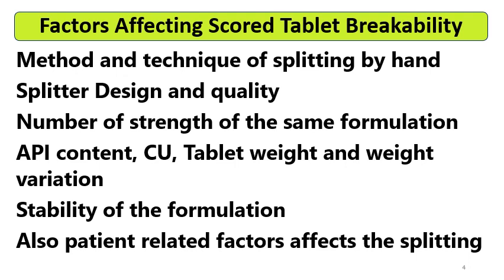So it is always desirable to have optimum hardness so that geriatric patients can split the tablets easily by hand. Always make tablet batches with different hardness, and whenever you are going to finalize the composition, always have the splittability, loss of mass data, and also stability data in hand for finalizing the formulation composition.